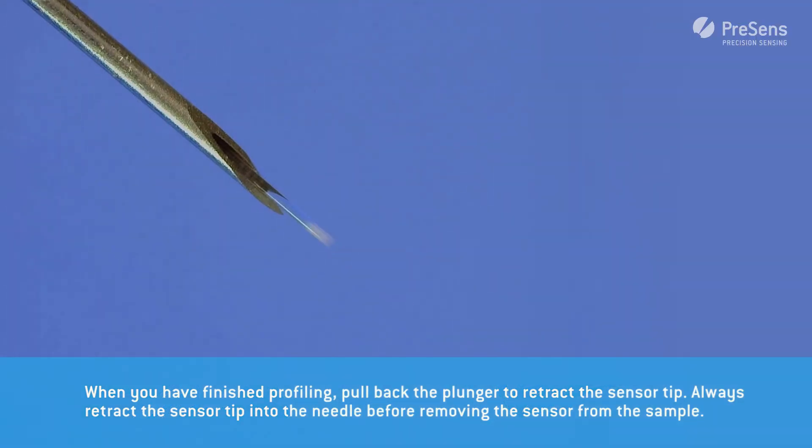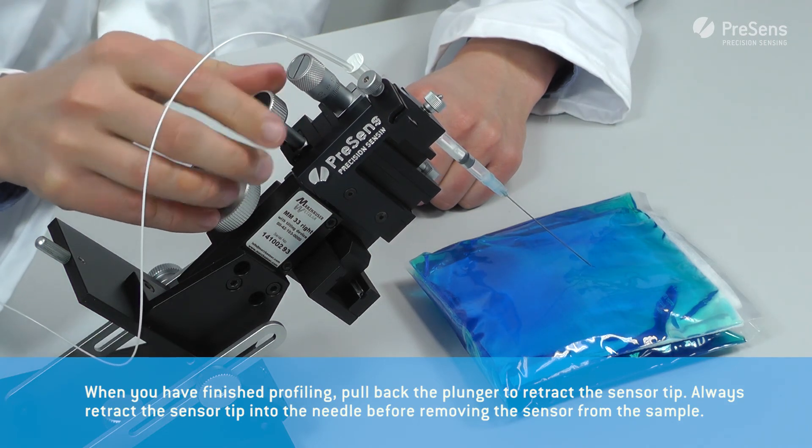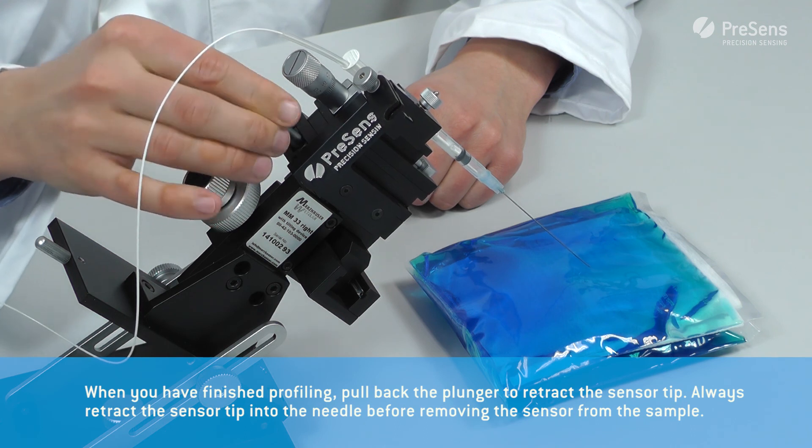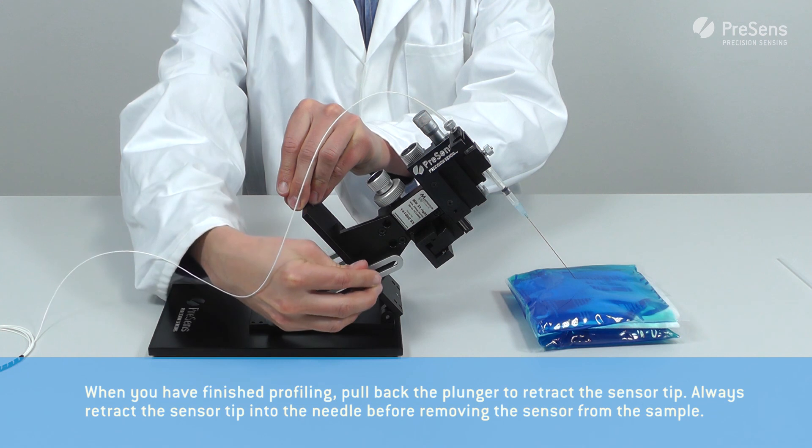When you have finished profiling, pull back the plunger to retract the sensor tip. Always retract the sensor tip into the needle before removing the sensor from the sample.